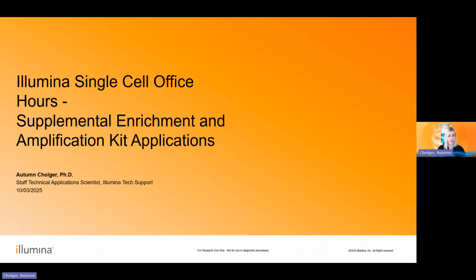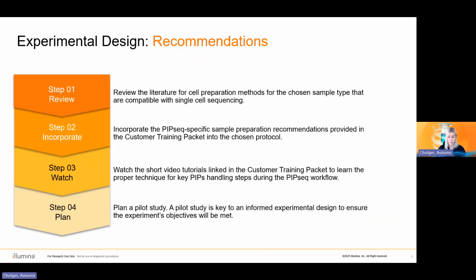And today's office hours is on the Supplemental Enrichment and Amplification Kit and its applications. And so that is what we're going to cover today. And we want to make sure that before we get started with any sort of advanced experiments, that we're starting from the basics. We're reviewing the literature for how to prepare our cells or use those antibodies, probes, staining molecules, synthetic nucleotide tags, what have you.